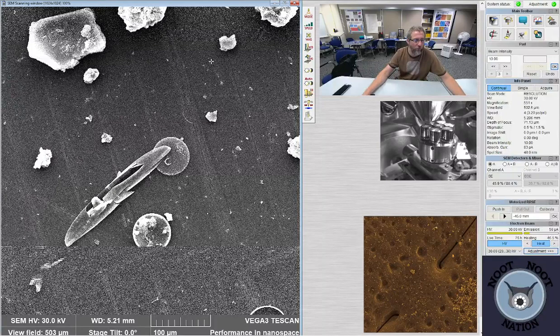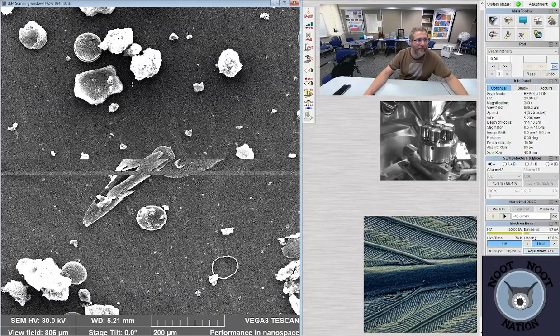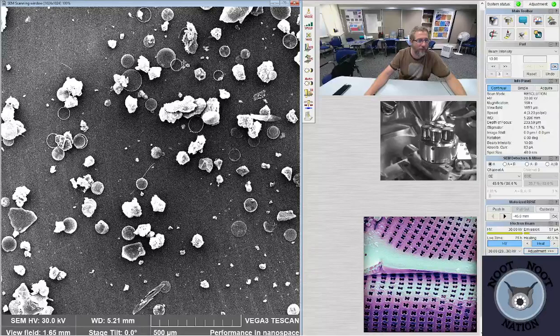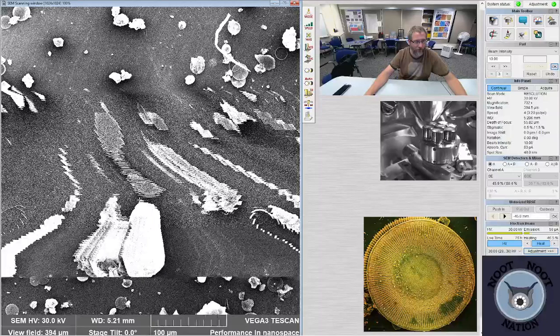And this is another diatom right here, this lima bean shaped thing. You can see all the little holes right there. They're not all round. A lot of times in Pacific plankton samples, there's a lot of round ones because a lot of the plankton is round. But diatoms have many different shapes, as we'll see. If you stick around and I jump over to the mountain lake samples, there's not a lot of round ones in it. Most of them are not round because they're benthic. The ones that float, that are drifters, tend to be round.